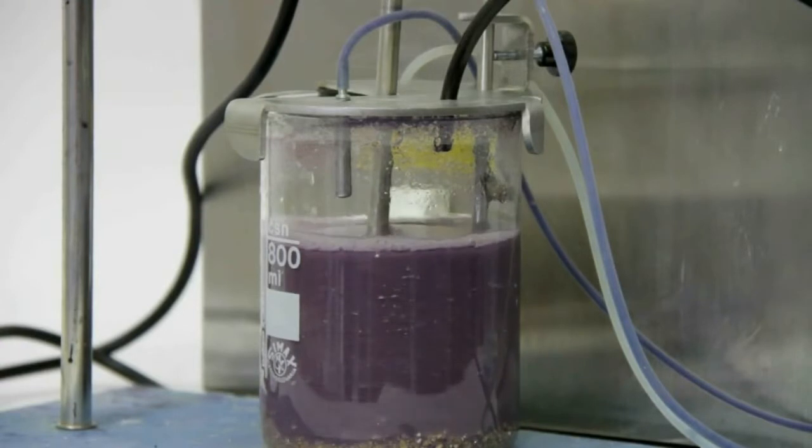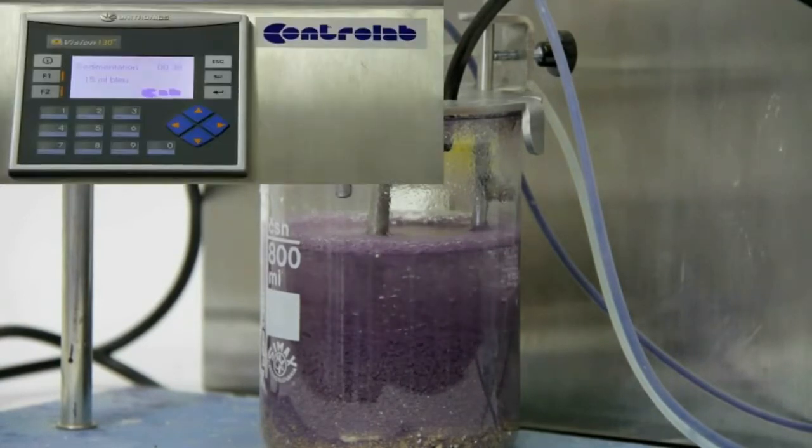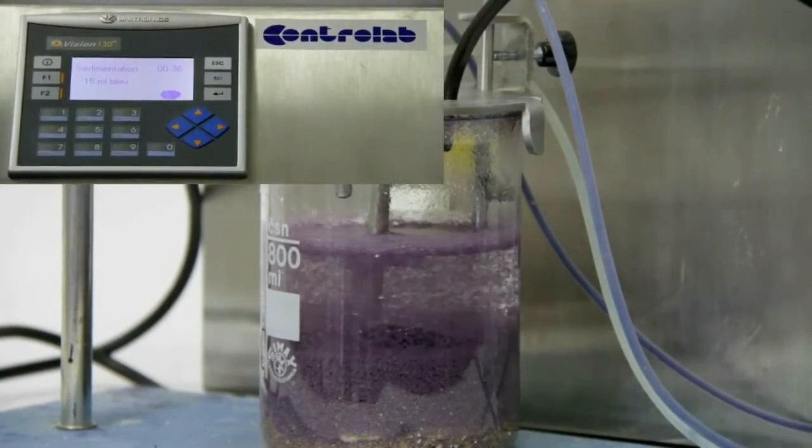The agitation automatically stops after the allotted time, then begins the sedimentation phase for analyzing the quantity of unabsorbed blue by clays present in the sample.